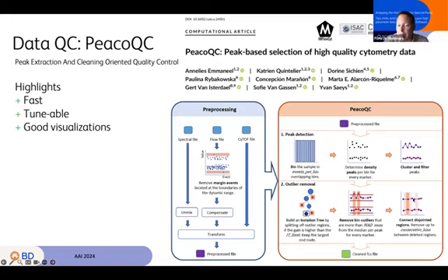And then we can take them out of the data through just removing a particular bin. There's also one extra step where we'll do another pass through the data and just look for things that are more than a tunable median absolute deviation away from the rest of the peak values, so that just in case the isolation tree allowed some particular outlier to get through, this will catch it. And then we put all of the bins back together that were good, and you've got your good data to work with. The data that shows some kind of anomaly is removed and dropped into a gate called bad events, and then continue on with your life.